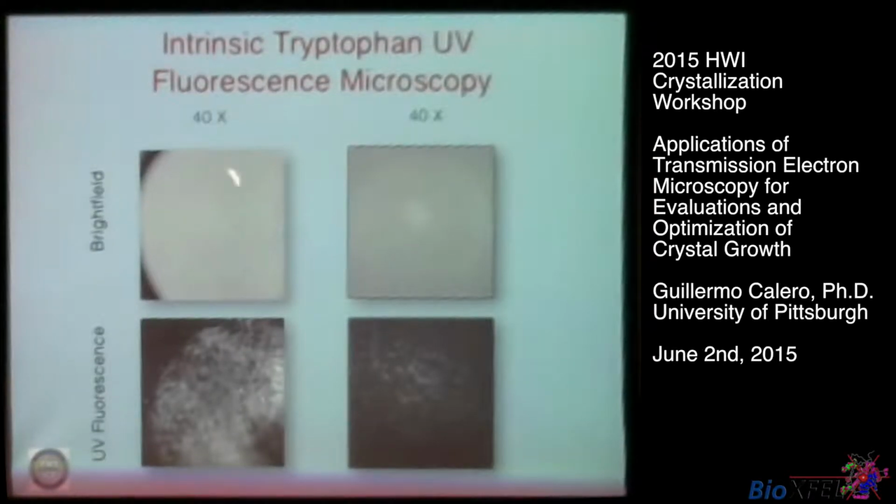In the bright field there was no indication that we had crystals, but when we look at it with a 40x objective of the UV fluorescent microscope, you can see that these samples were positive. So using UV fluorescence, we were able to narrow it down to a smaller number of aggregates that we were going to look at.